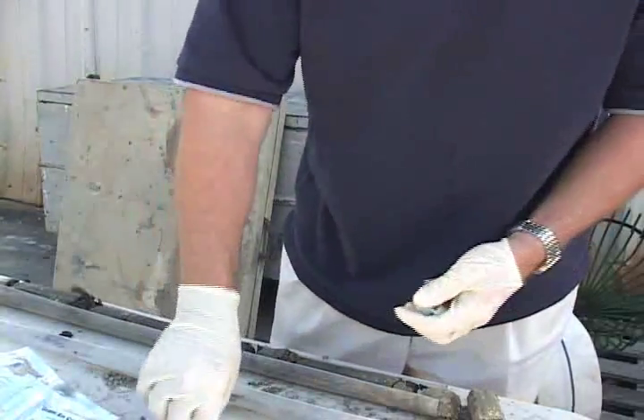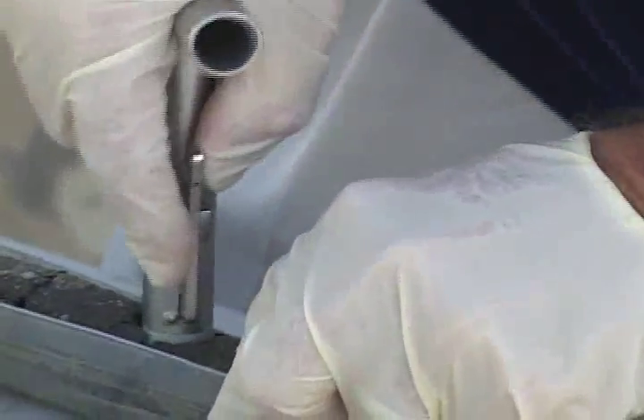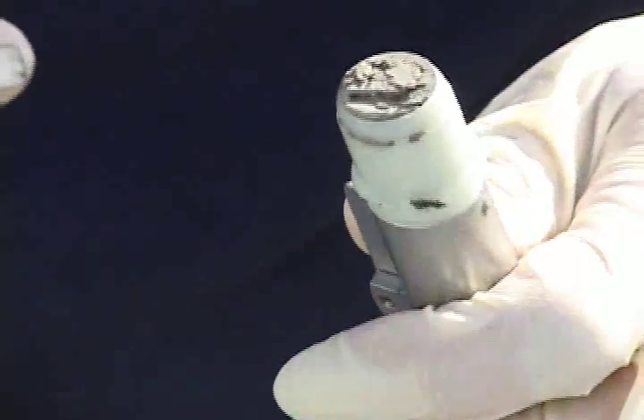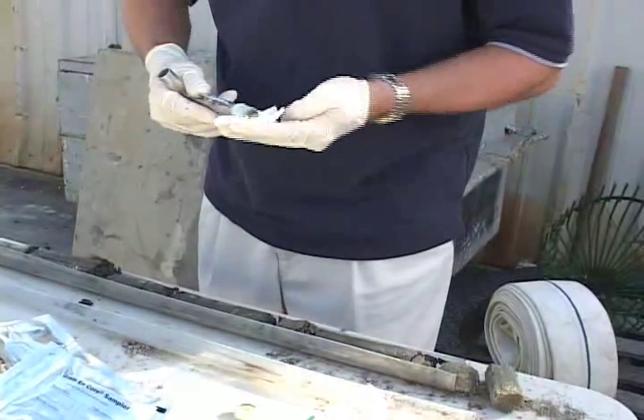The soil samples need to be taken very quickly from the interval area with the highest contamination reading and right next to the hole that was used for screening. Here you see the crew member scraping off excess soil, quickly cleaning the walls of the container to eliminate soil contamination, and then capping the sample.